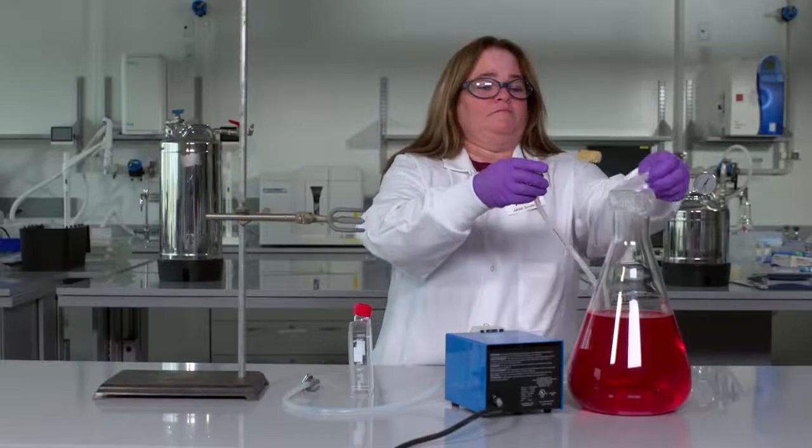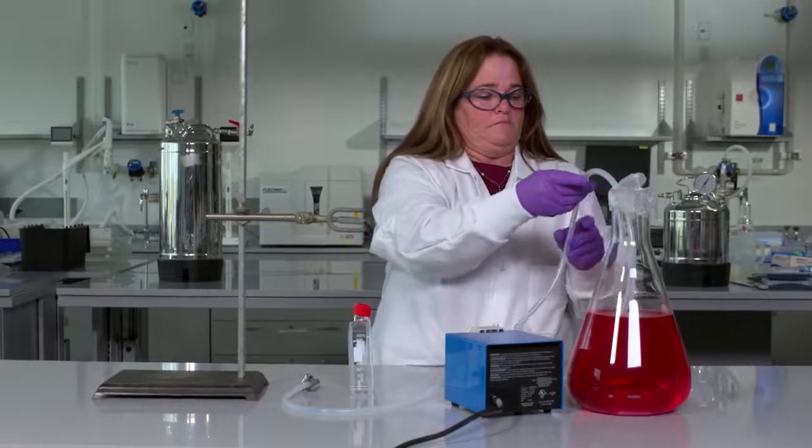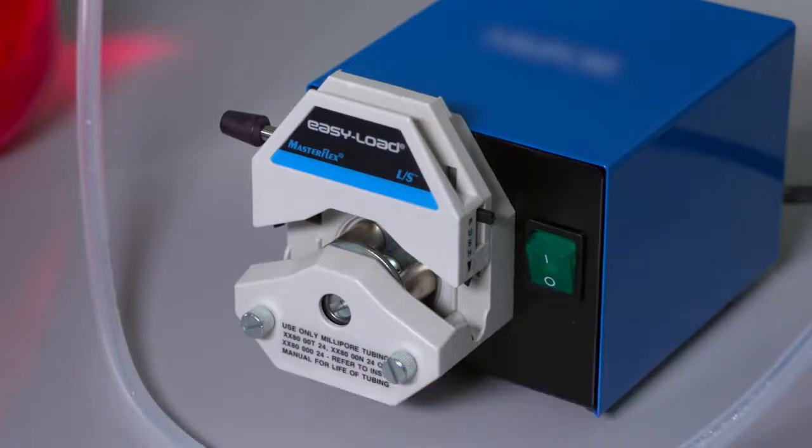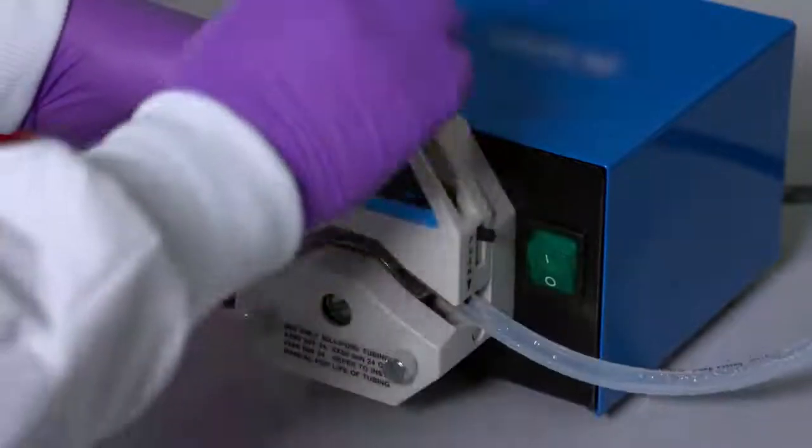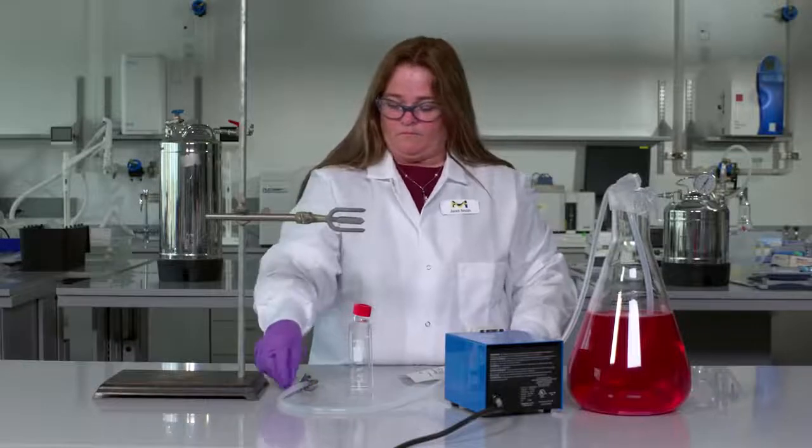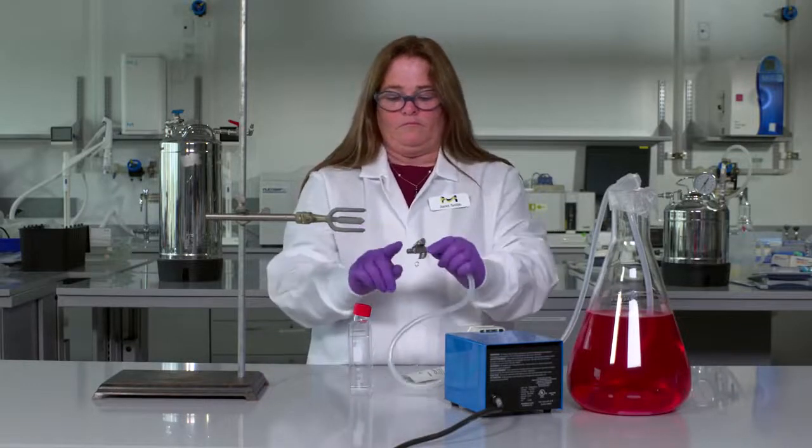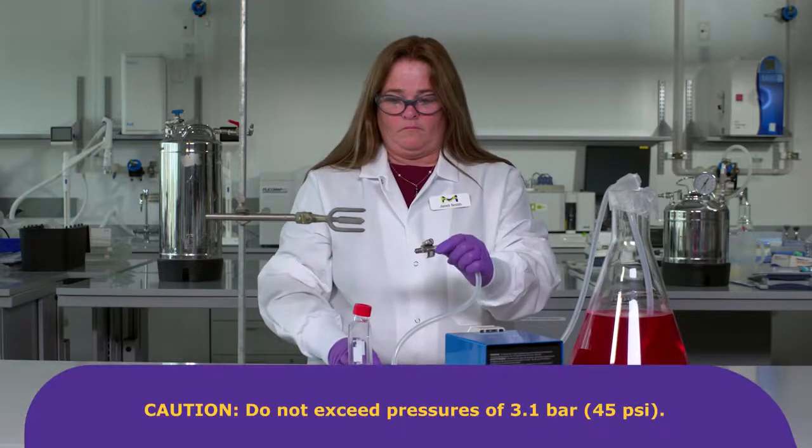Fill a flask with the solution to be sterilized. Prepare a peristaltic pump. For best results, use a pump drive and pump head that can deliver a flow rate of approximately 100 mils per minute at the speed of 60 rpm. Load the peristaltic pump head with 4.8 mm silicone tubing and attach a 6.4 mm hose barbed lure lock adapter to the outlet side of the tubing. Do not exceed pressures of 3.1 bar.